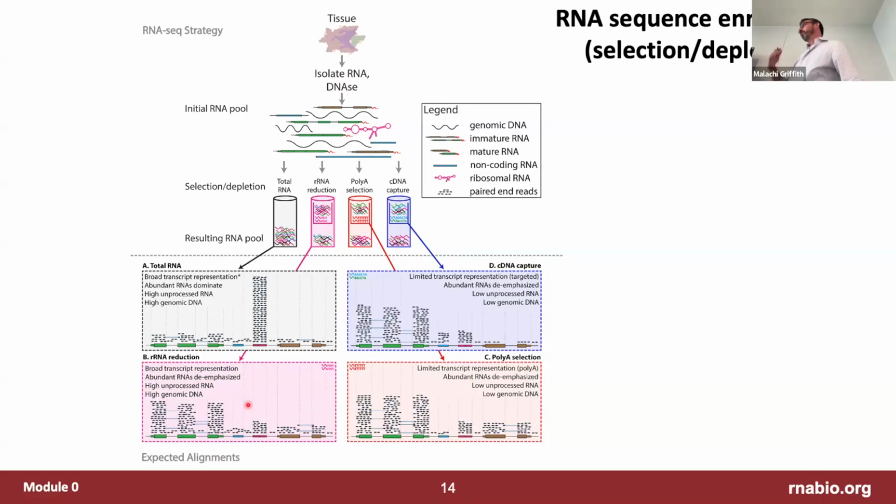So you design or you order a set of probes that have been designed to match the ribosomal RNA species of your organism. You run your RNA sample on a column. The column grabs all of those things by hybridization, and you wash through everything else, and all of the stuff that comes through is the transcriptome, but now you've subtracted out these ribosomal species.